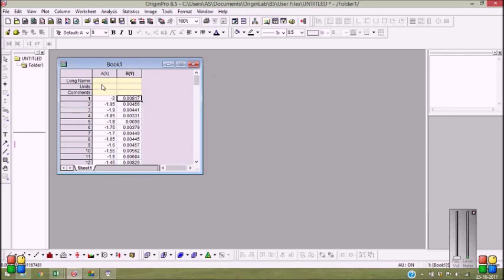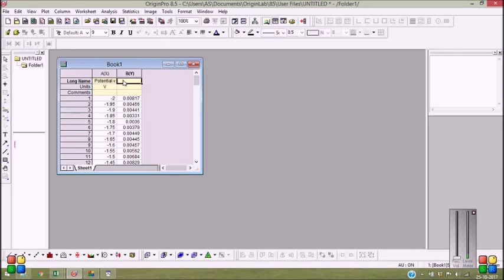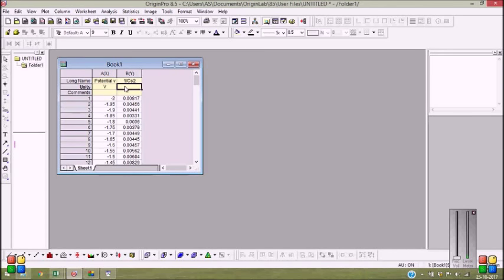It's fine. Now let me write this. Potential versus Ag/AgCl and it is volt. And this is 1 by Cs square, times 10 to the power 9, Farad to the power minus 2.